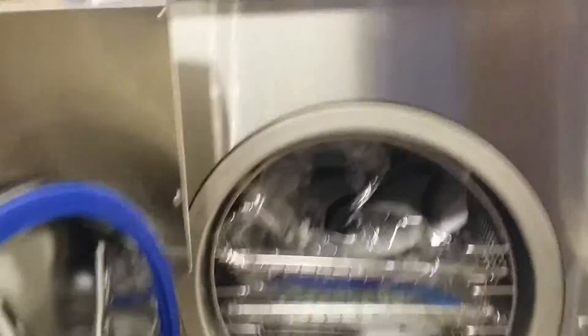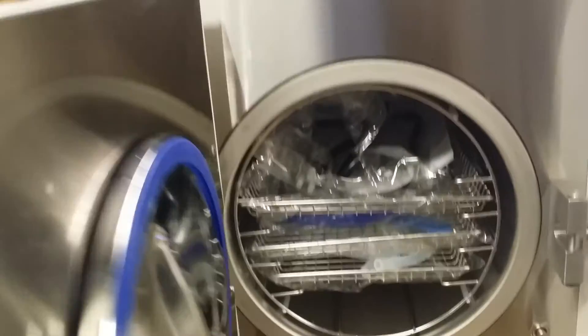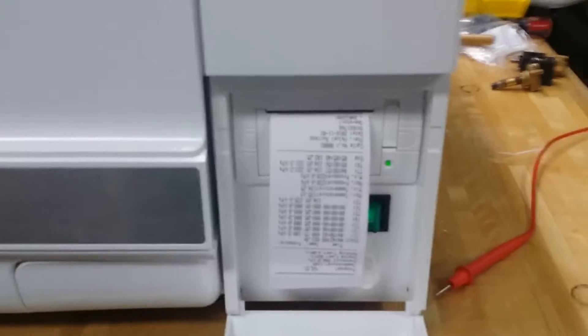It's fully automatic and very easy to use. You just close the door and push it. On the right side you can open a panel, and you'll see there's a built-in printer — it comes with the printer already included.